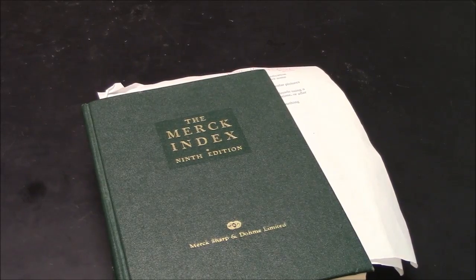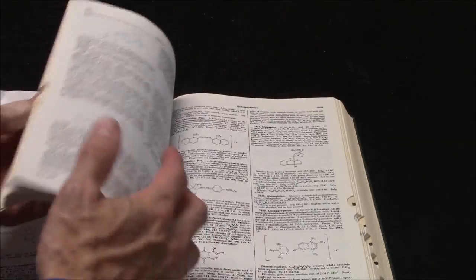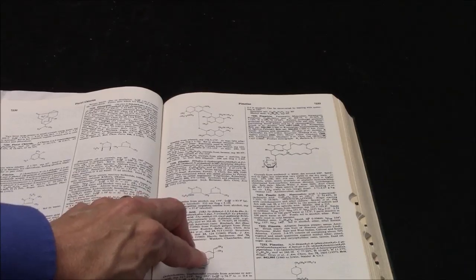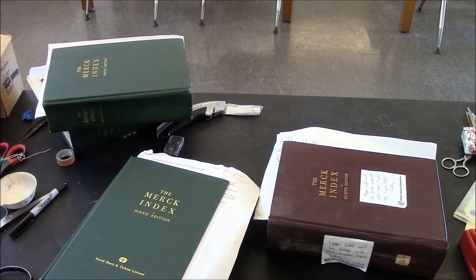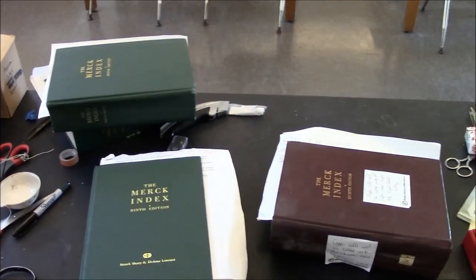The instructions mention the use of the Merck index as a lifeline. You get one opportunity to look something up in the book. For example, you might say, I need to know the properties of potassium carbonate. So you'd find the section in the book that corresponds to potassium carbonate, and if you read it, it will tell you properties of that, such as color, solubility, etc., and that may help you make a definitive conclusion. There are several Merck indices on the buffet table. Take one, borrow it, look it up at your table, bring it back when you're done.